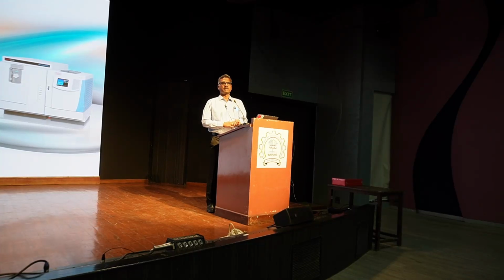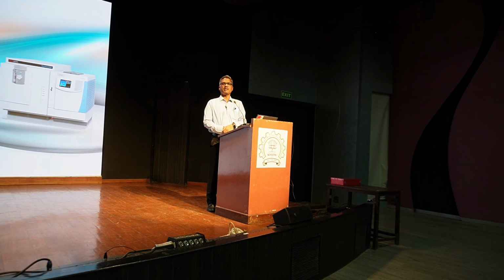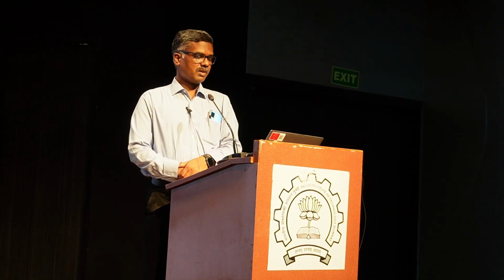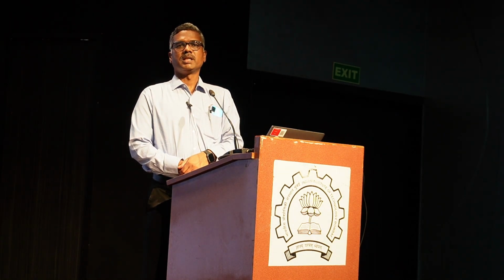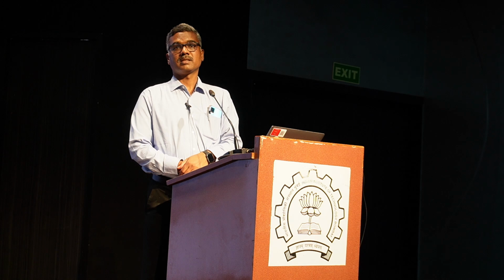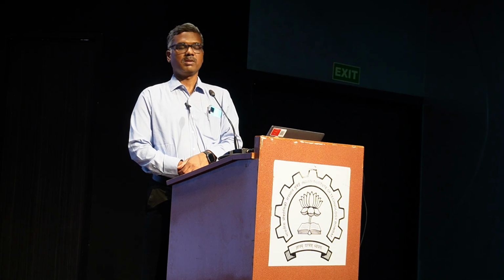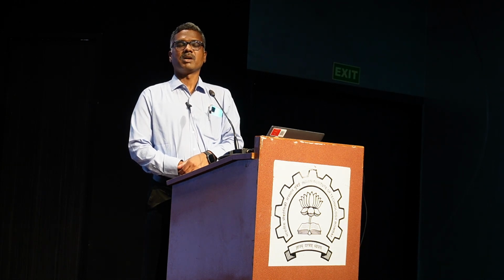Good morning, team. As Sunil has set up the baseline for understanding mass spectrometry, especially with respect to high resolution mass spectrometry, what is the importance of high resolution mass spectrometry in our day-to-day analysis, as well as in research or any academic project you want to work on? How does it play an important role in reaching your exact objective in terms of the identification of your correct molecule and their confirmatory criteria?